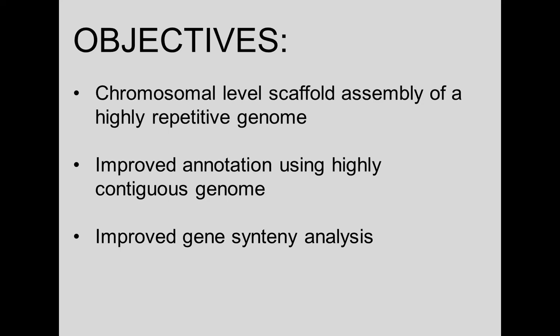So our main objective for carrying out this project was to obtain a chromosome-level scaffold assembly for a highly repetitive genome.